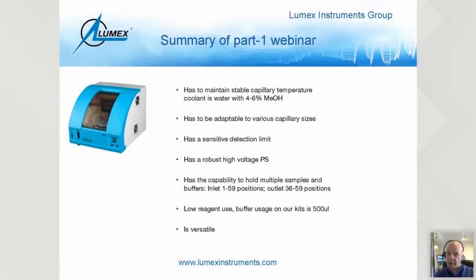And the reason why I bring in the 500 microliter mark is because, of course, there's savings there. So you have twice as much. And our kits are actually tested to run at 500 microliters, which enables you to do more runs per kit.